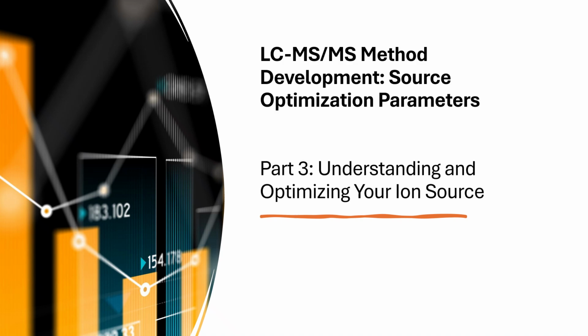Hello everyone, welcome back to part 3 of our LC-MS/MS method development series. In our previous videos we covered compound optimization and chromatography, and today we are diving into one of the most critical aspects of achieving optimal sensitivity and reproducibility, that is source optimization.